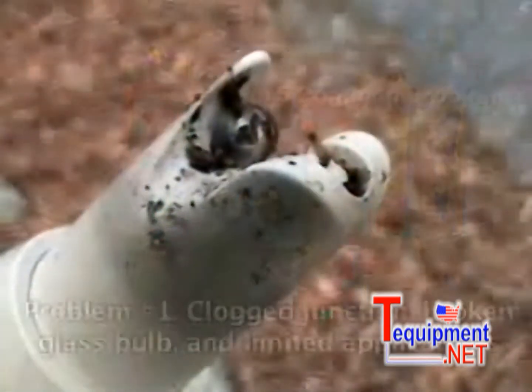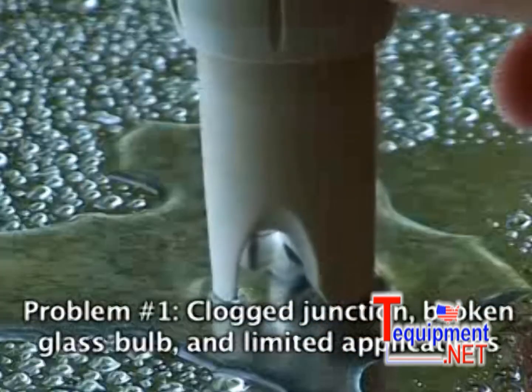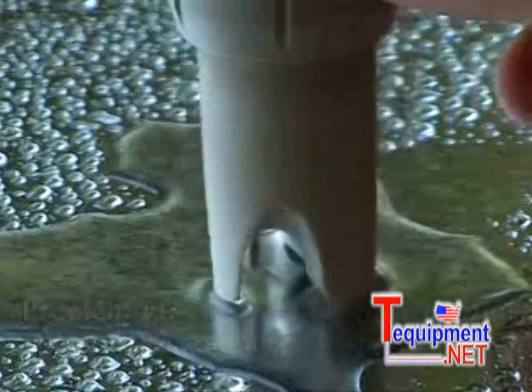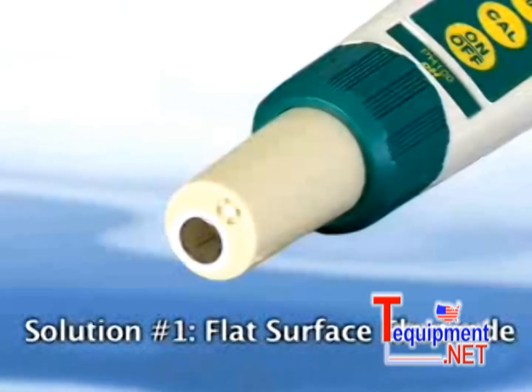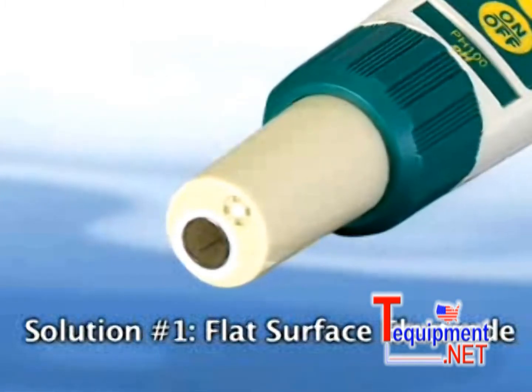Problem number one: traditional glass bulb pH electrodes tend to get clogged or easily broken and are limited to liquid measurements. The EXTIC pH meter is the world's first stick-sized pH meter designed with a flat surface electrode.